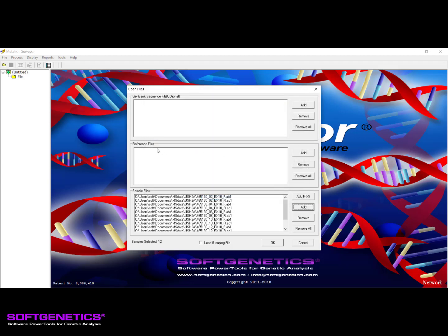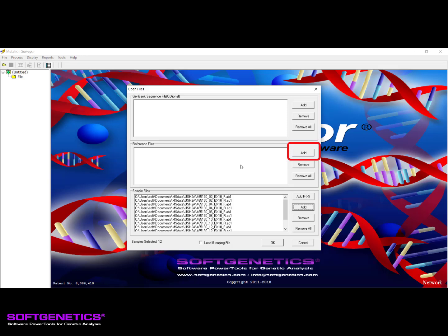The field above the Sample Files field is for loading your reference files. In Mutation Surveyor, the term reference represents a negative control or wild type trace file that is being used to compare against the sample trace files for mutation detection. Manually loading references are strongly recommended when detecting low frequency variants and work best when they are from the same run as the sample files being analyzed. If no reference trace files are loaded, the software will synthetically generate ones using the nucleotide string from the GenBank file and the peak intensities from the highest quality sample trace files.